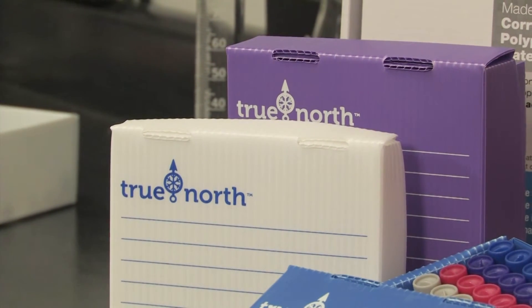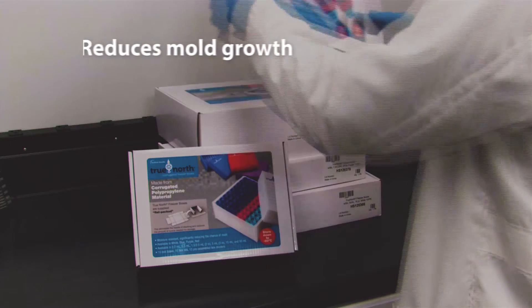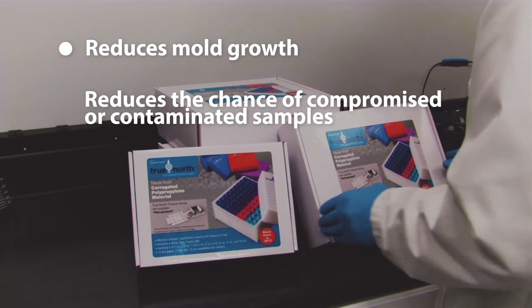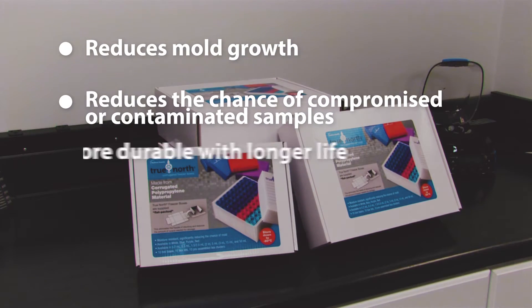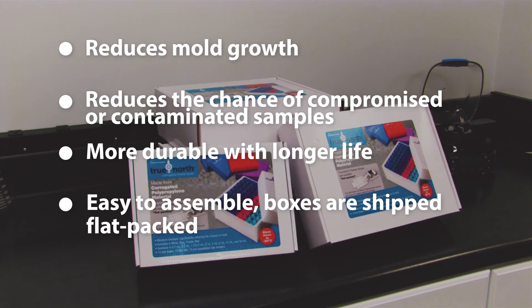True North freezer boxes by Heathrow Scientific were designed with sustainability in mind: reduces mold growth, reduces the chance of compromised or contaminated samples, more durable with a longer life, easy to assemble, and boxes are shipped flat packed.